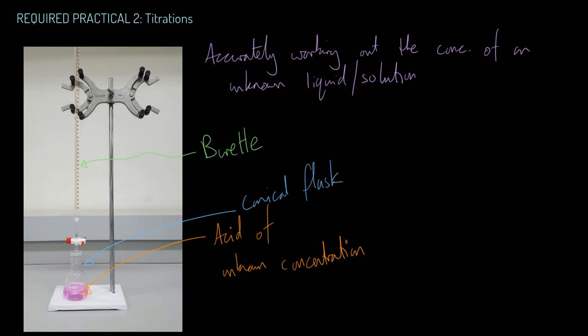And finally, this at the bottom, this might not seem like terribly much, but you need some sort of white base for reasons that we will talk about later. I use a white tile. In this case, it looks like paper. This picture has come from the very nice people at Wiki Commons, as have many of my pictures today, so thanks very much for that, guys.